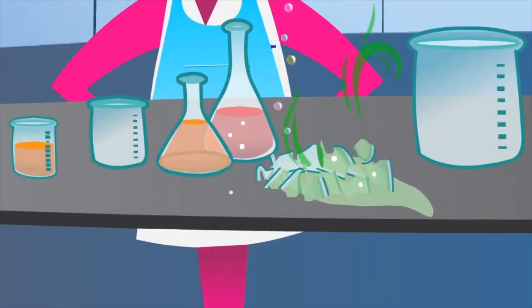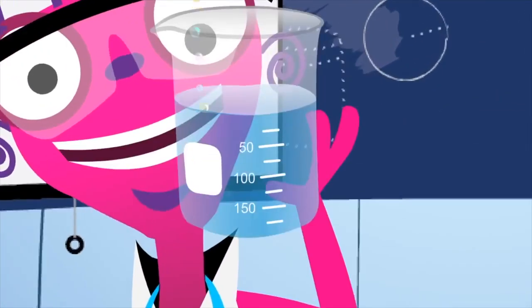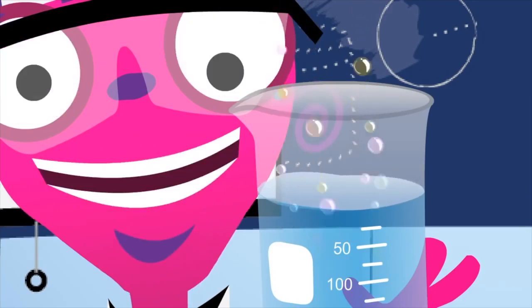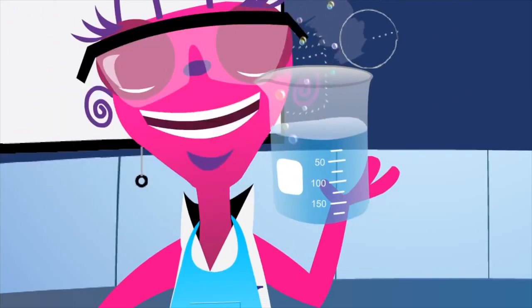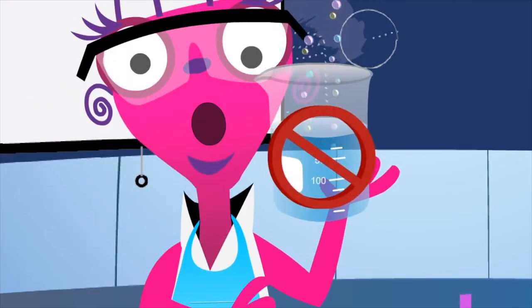Notify your teacher if there's an accident or spill! And never smell a chemical directly! You'll be sorry! Oh yeah! You'll be sorry! Oh yes you will!